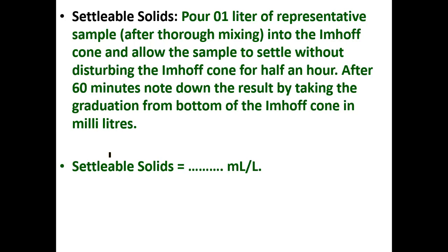Now, how will you calculate the next part? There is something called settleable solids. The solids which are likely to settle under their own weight are called settleable solids. For this, you take 1 liter of representative sample, whether wastewater or water sample, thoroughly mix it and put it into something called an Imhoff cone. This Imhoff cone is used to calculate settleable solids. Once you pour that 1 liter into the Imhoff cone, allow the sample to settle without disturbing the Imhoff cone for, actually, it should be 1 hour. It is given as half hour here.